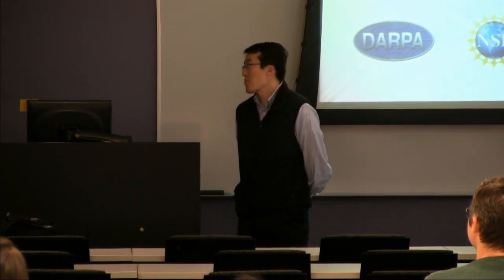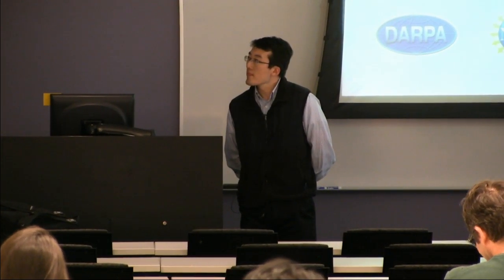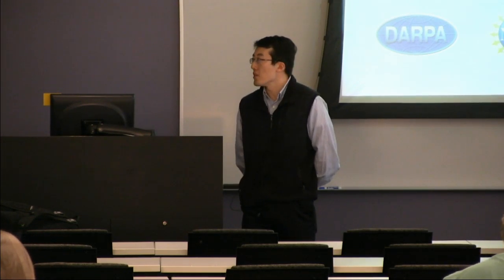All right, I will start. Do all of these techniques that you showed use added probes, or do any of them use endogenous fluorophores or chromophores for the imaging? Or are they all added? Yeah, most of them are fluorescence, just with labels. Is there anything that can use natural signals? Yeah. A lot of techniques are compatible with, for example, label-free or intrinsic signals in the sample. Just for example, the miniscope can image intrinsic signals and also phase information from the sample.